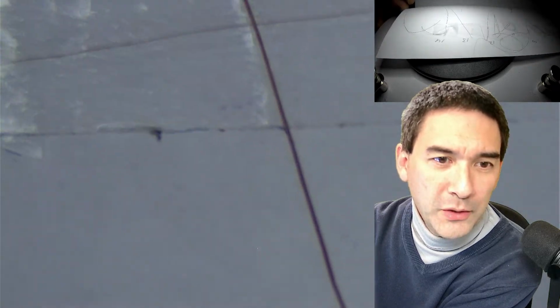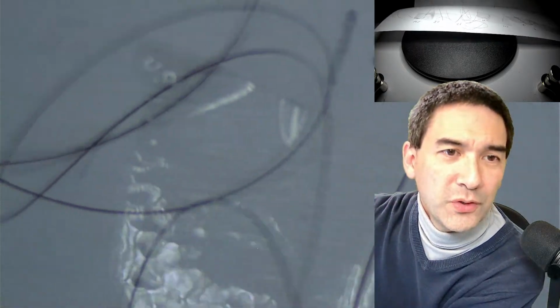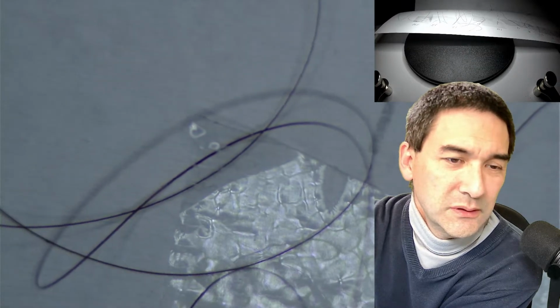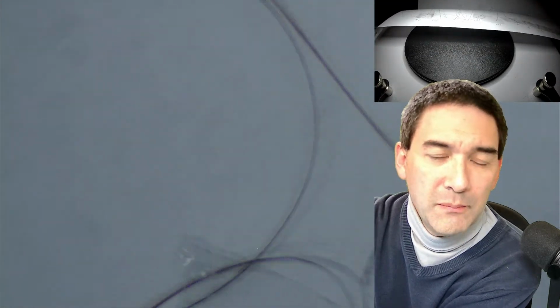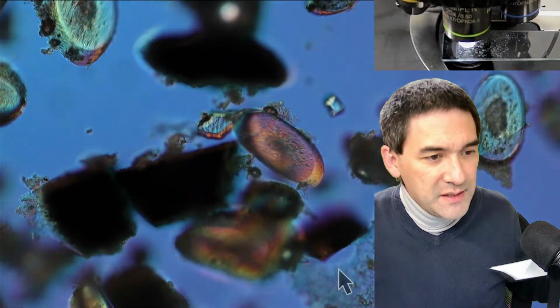However, under the compound microscope, everything looks significantly better. You see, we can zoom out yet further. That's the maximum that I can zoom out. It's a little bit blurry. And of course, it is not entirely satisfactory, right? For this reason, I've prepared this microscope slide. Let's switch this off again to save a little bit of electricity here. And for this reason, I prepared this microscope slide.